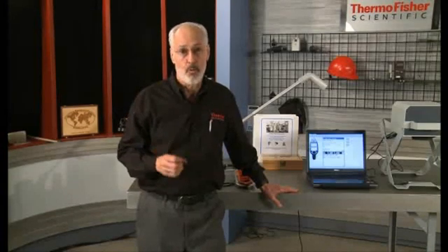Module 4.1, Residual Element Content. A new PMI application for the analysis of residual element content in carbon steel piping and welds has recently been developed for the Thermo Niton XL3T. This new capability is made possible with the improved detection limits now obtainable using the XL3T 900 with gold technology.